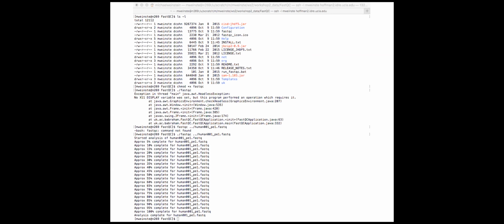Was anybody getting any weird errors when you tried to run fastqc, giving it a file name to work on? Where it says skipping /human001 for Ellen O'Connor, you should have a slash between the dot and the h. So for Ellen O'Connor, try applying that solution and let me know if it works.